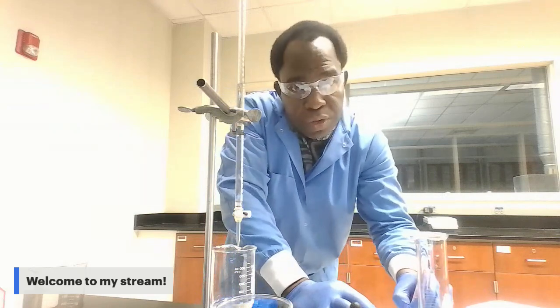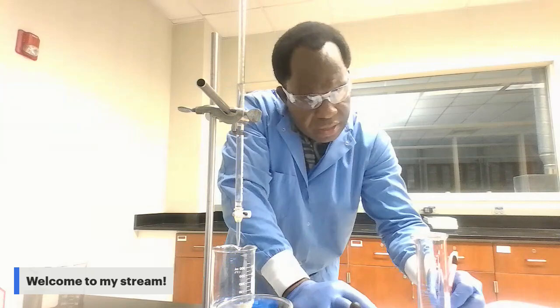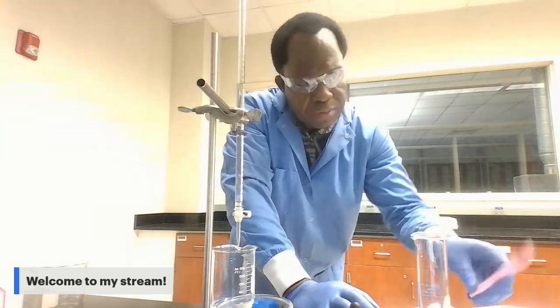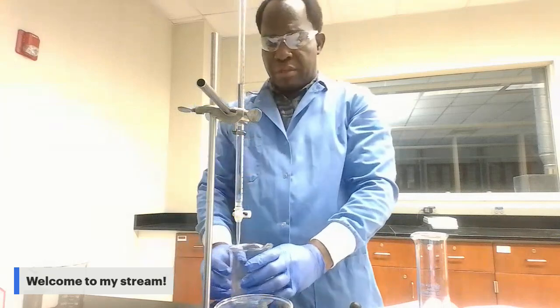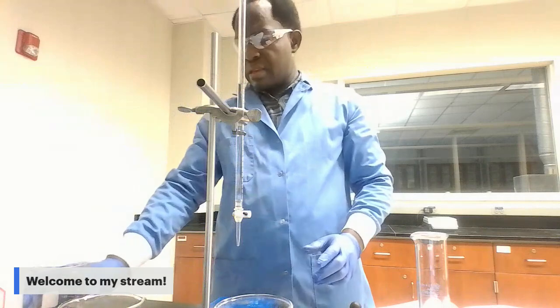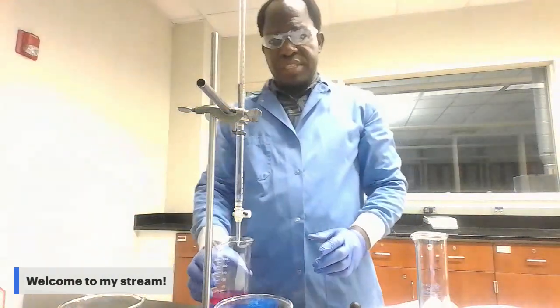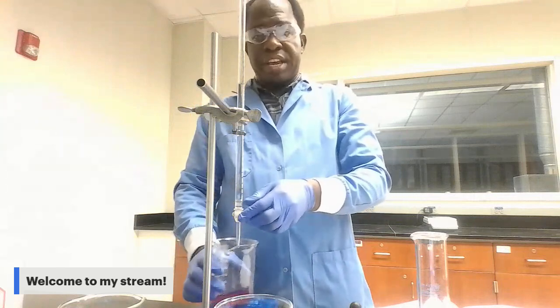So 29 milliliter minus 15 milliliter is equal to 14 milliliter. That's the second volume of HCl I use for the second beaker, the solution of CaOH2 in the second beaker. Now I'm going to move to the third beaker.